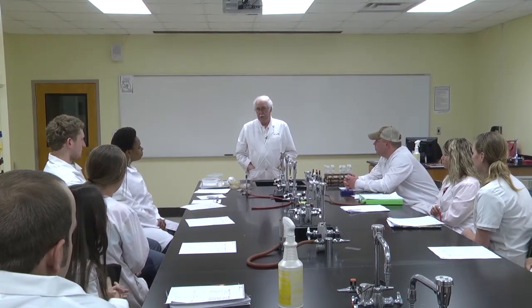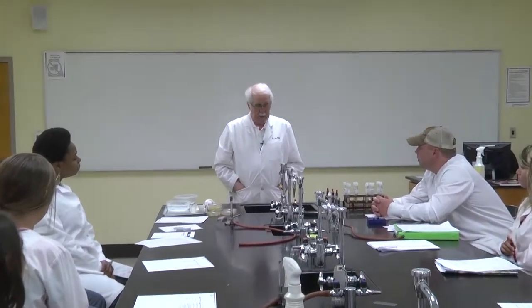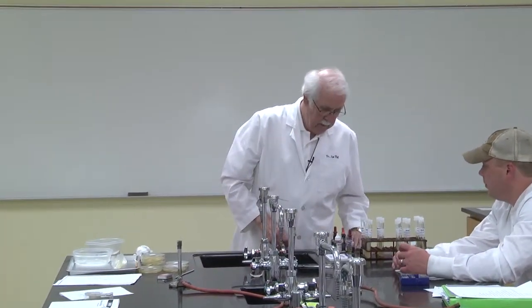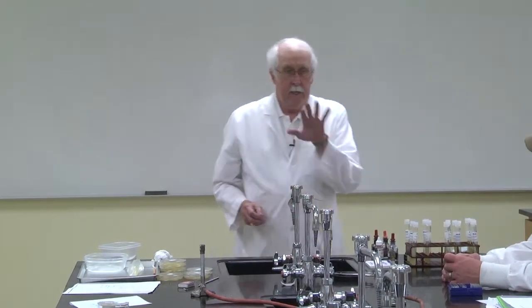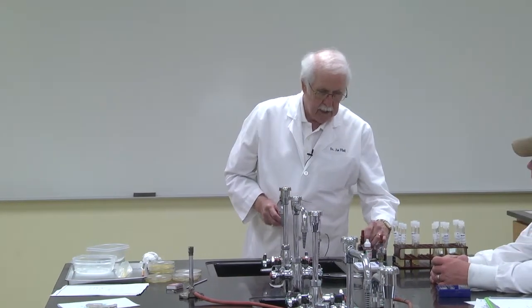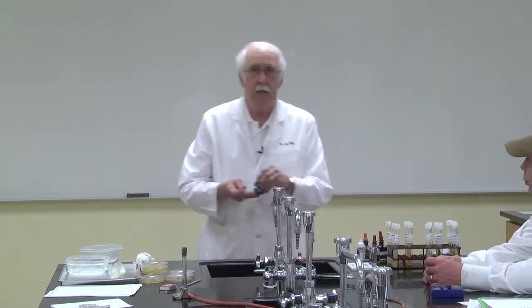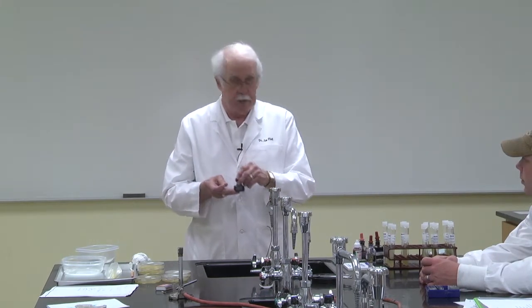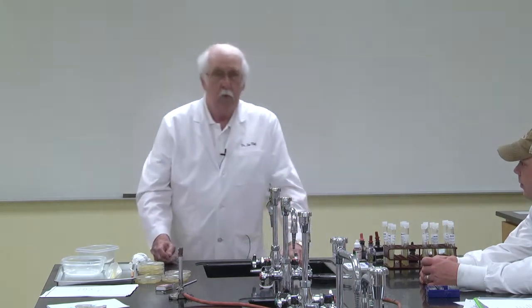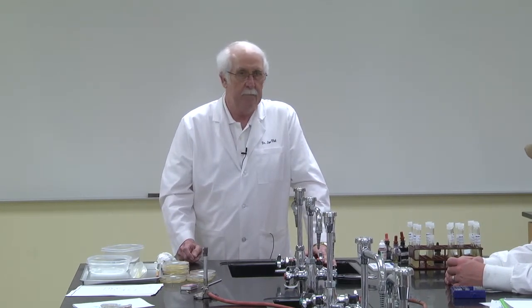The simplest procedure is known as the negative stain, also known as a capsule stain. To do this, we put a single drop of nigrosin at one end of a slide. This is sometimes called a capsule stain. The nigrosin is an acidic stain, and India ink can also be used for this. It's an acidic stain also. And with a capsule stain, we also counterstain by using a basic stain such as safranin.